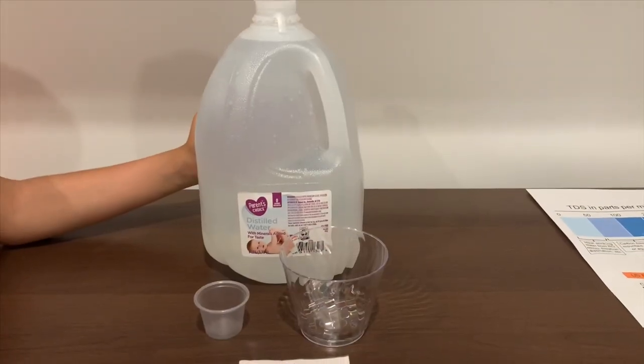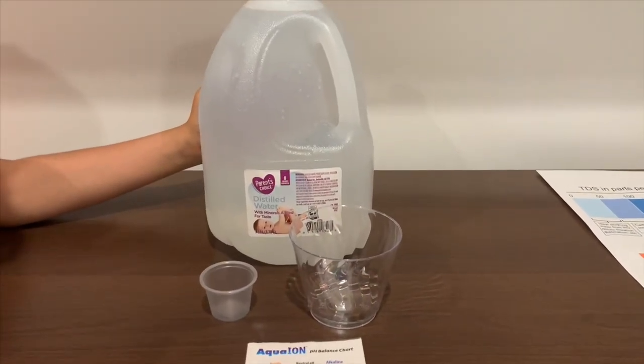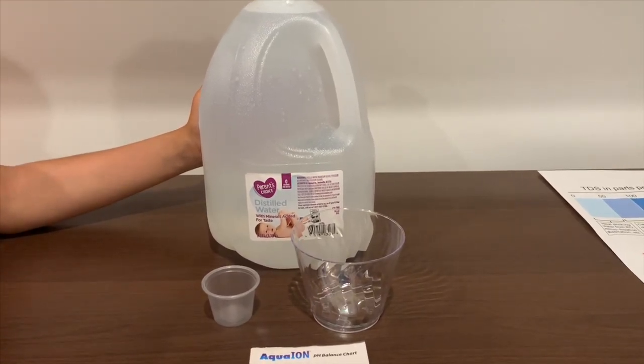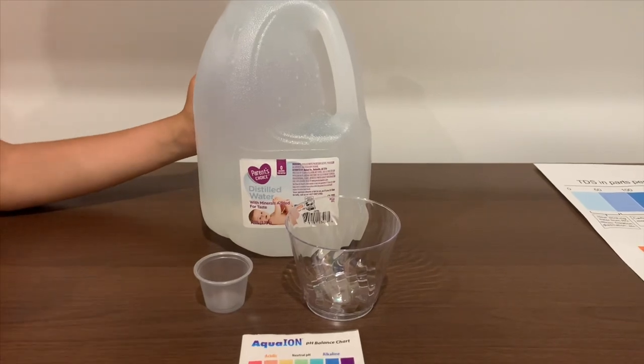This is Perrin's Choice distilled water with minerals added for its taste. You can buy this at Walmart stores — it costs $1. Let's test the pH and TDS levels.